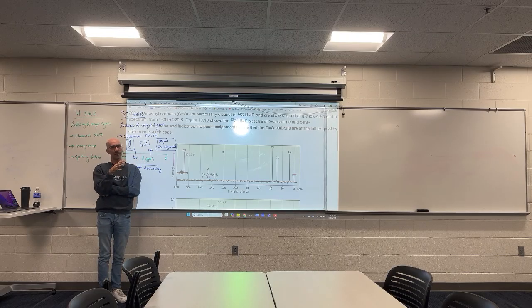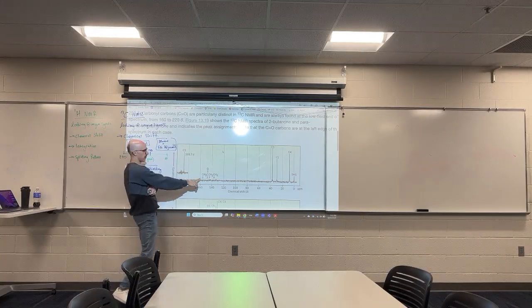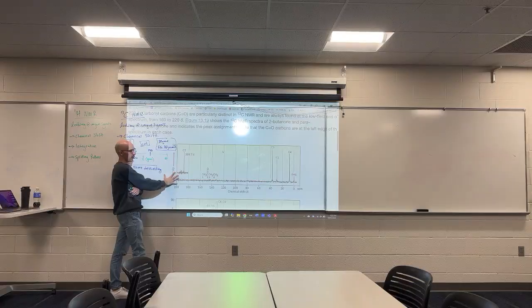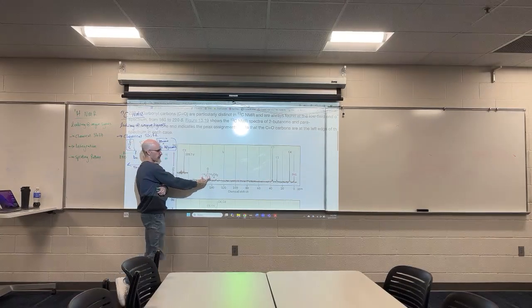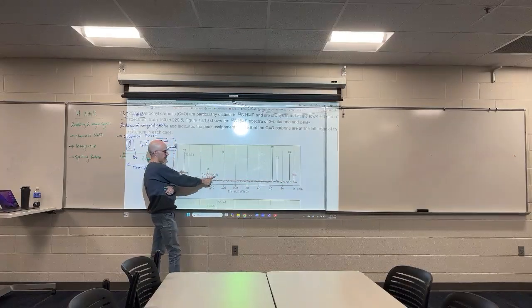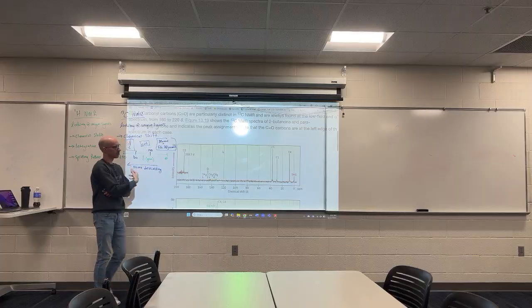So you can't just as easily look at a carbon NMR and figure out how many carbons total there are, just how many types of carbons there are. And of course, you'll notice the carbon of the carbonyl in this compound is the one that's shifted all the way left. The carbons that are close to the carbonyl are shifted more left than the carbon that is far from the carbonyl. Those experience more de-shielding.